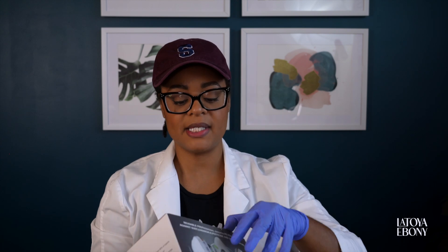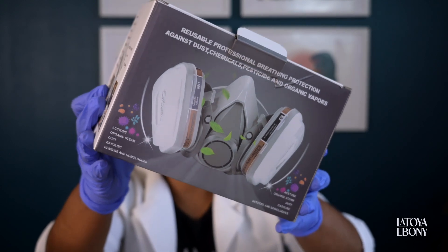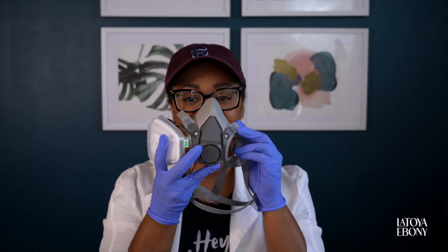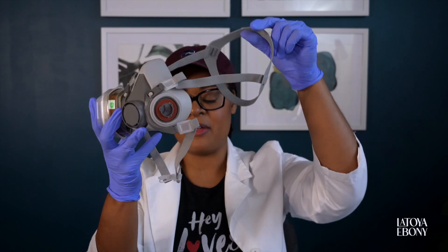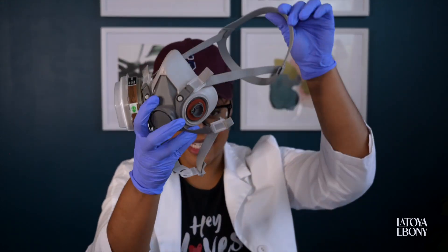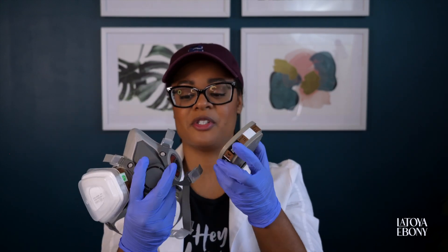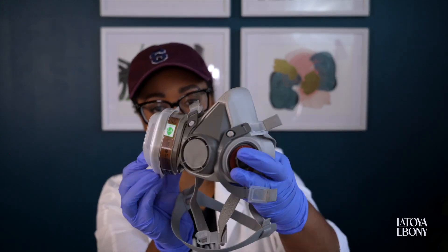Safety in a lab is so important and you need the proper gear. One of the pieces I was missing was a respirator. Let me open it for the first time — it's actually broken up into a bunch of different pieces. It comes with goggles. This is the part that goes over your nose, the strap goes over the back, and it comes fully disassembled so you have to assemble it yourself.